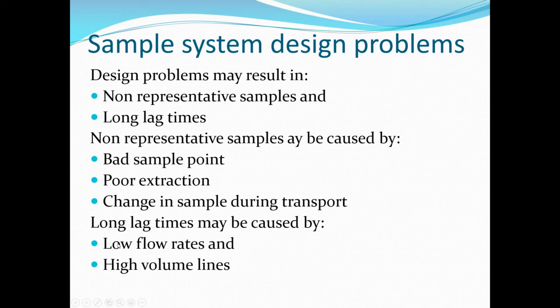Long lag times can be caused by low flow rates or high volume lines. So we learn that we can either increase the flow rate or reduce our volume in order to speed up our transport time. These are all the things that we've discussed, and the issues that we hopefully have provided you with the tools to overcome should you see any of these problems in the field.